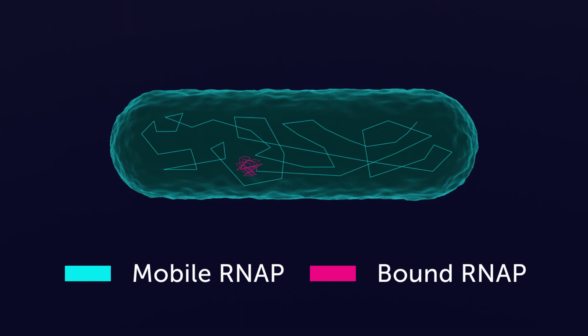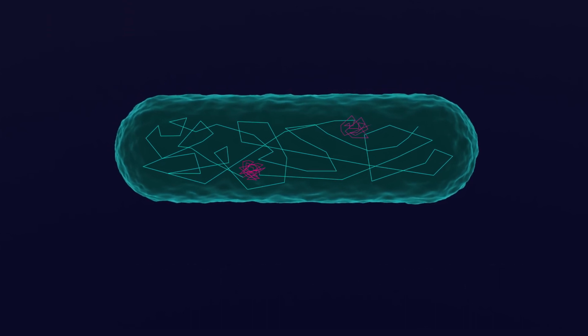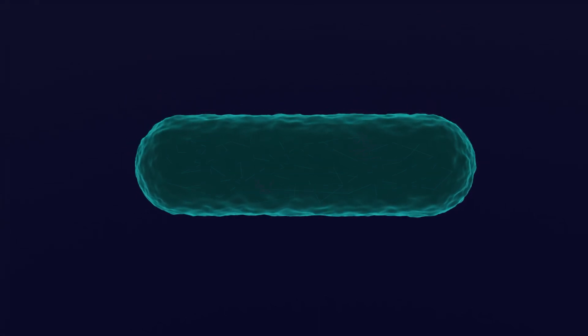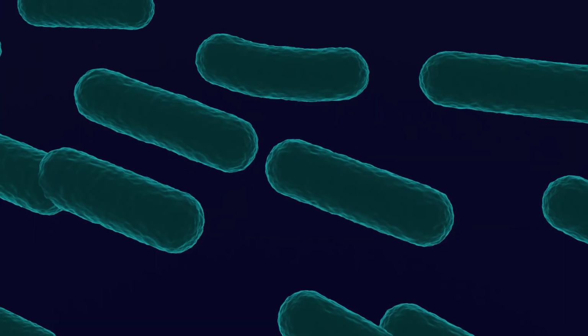whilst transcribing genes. These techniques provide greater understanding of fundamental mechanisms in biology, such as the mode of action of antibiotics, and enable us to develop better synthetic biology and biomedical tools.